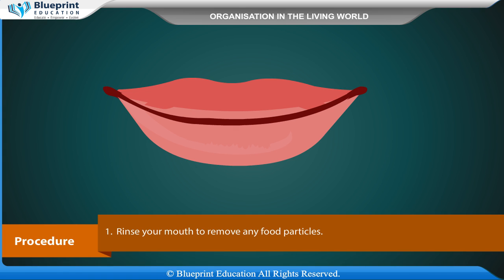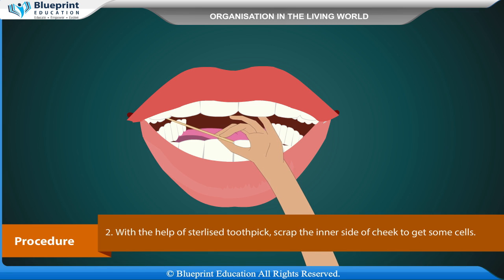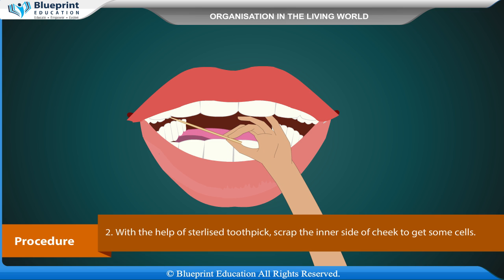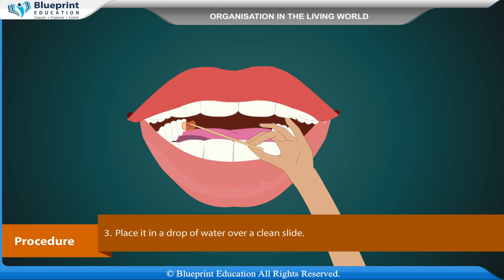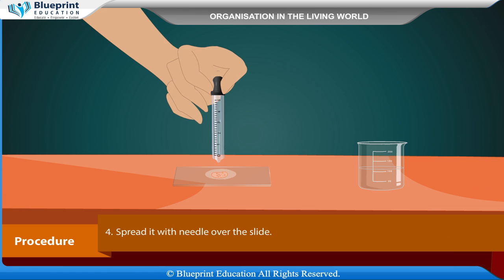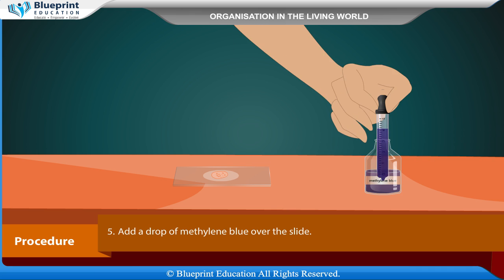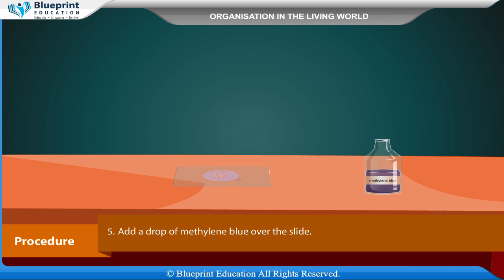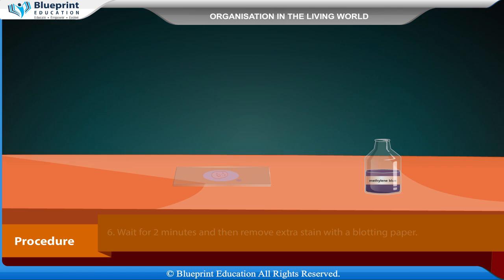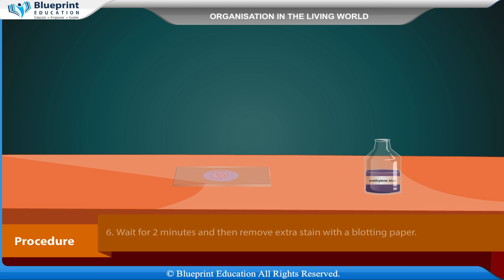Procedure: Rinse your mouth to remove any food particles. With the help of a sterilized toothpick, scrape the inner side of the cheek to get some cells. Place the scraping in a drop of water over a clean slide and spread it with a needle. Add a drop of methylene blue over the slide, wait for two minutes, then remove extra stain with blotting paper.